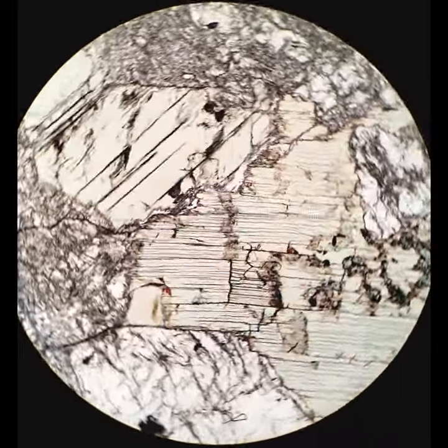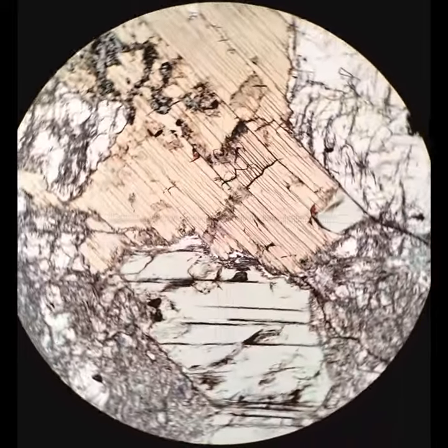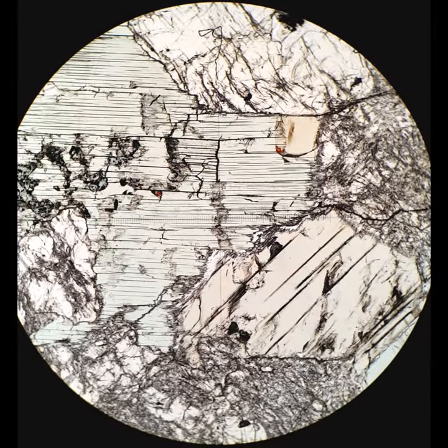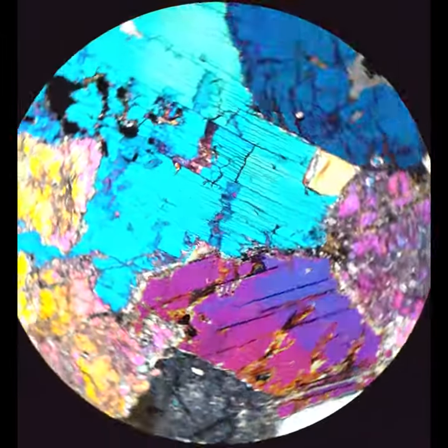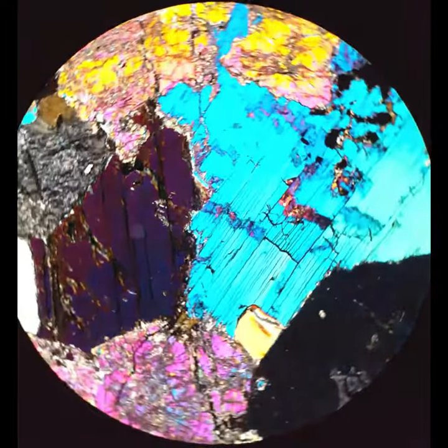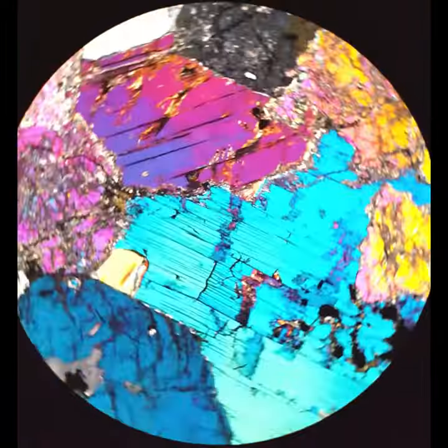I would not be able to identify clintonite routinely in a rock. I happen to know that this rock has clintonite in it, and so that's how I'm able to make these videos to show what it looks like.